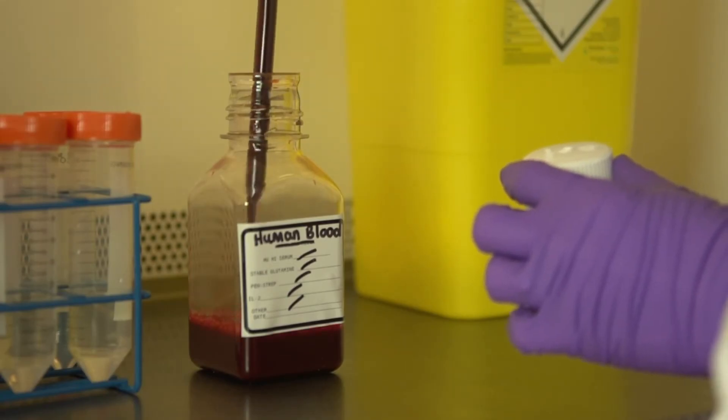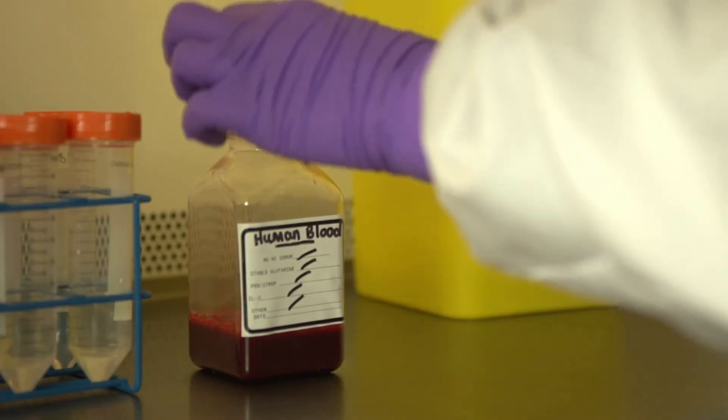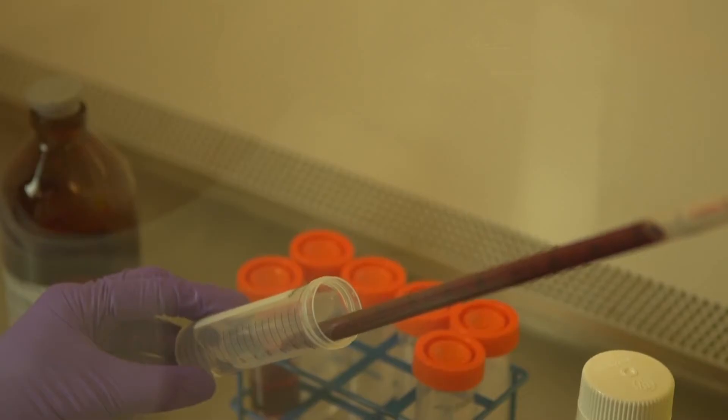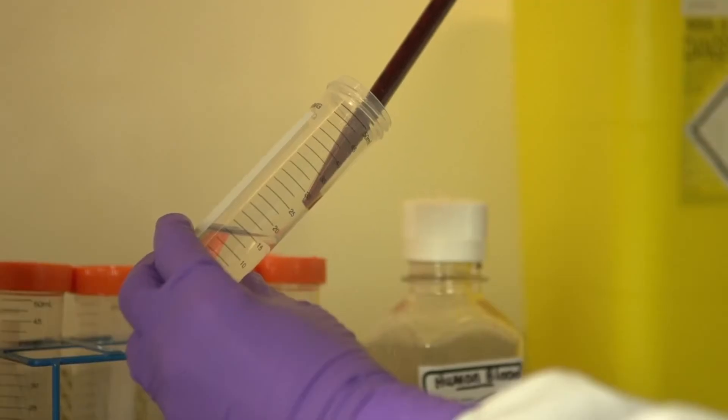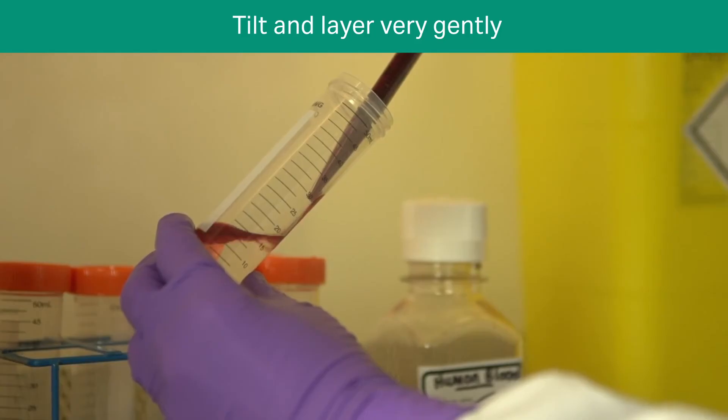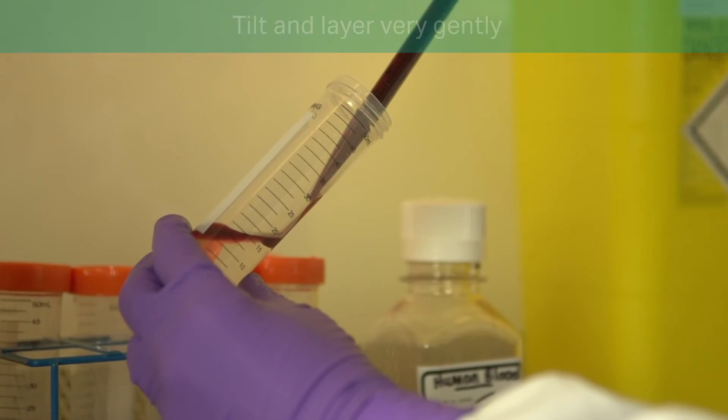Take 25 ml sample of blood. Tilt the tube containing the Phycol and very gently layer the blood on top, taking care not to disturb the interface.